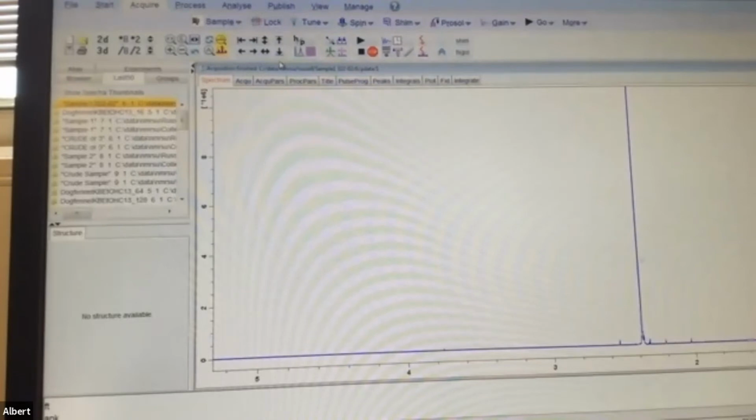methyl proton on the ester. So if you look at the structure of aspirin, the ester part, that's the CH3 that's attached to it, the acetyl proton. All right. So that's a really good sample. It's very clean. Scroll back down to the aromatic.